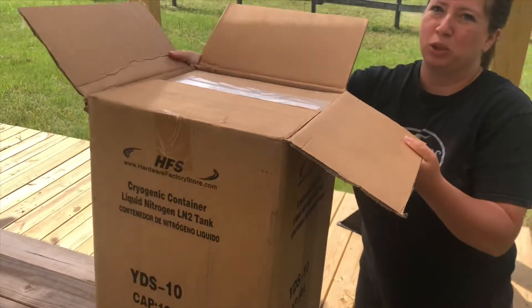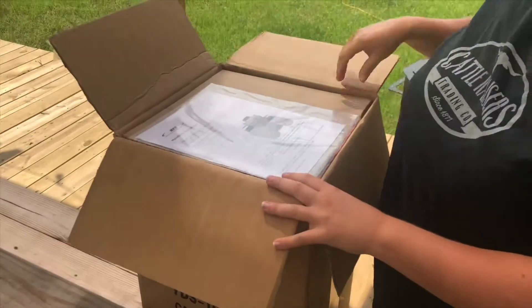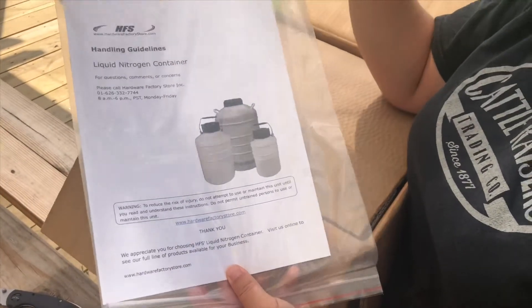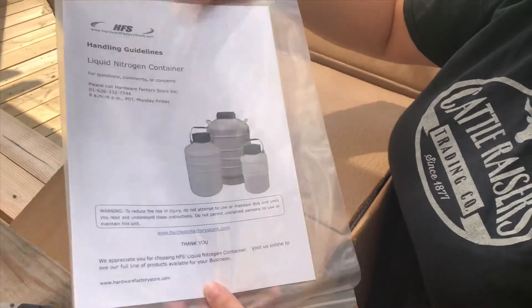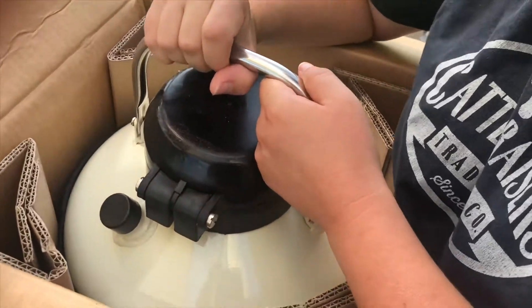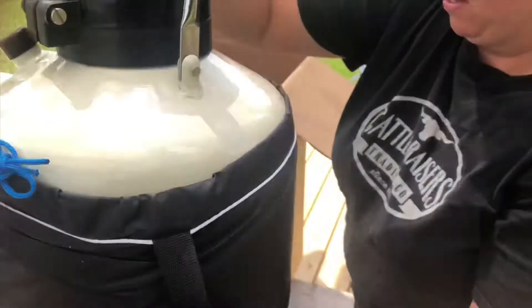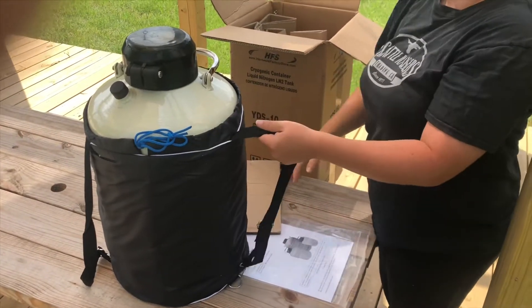I'm going to pull it down to my level because I'm a short person. Just a little bit about it — the handling guidelines and everything else. Of course, if you're ever messing with liquid nitrogen, please wear gloves. I know a lot of people don't. This is the actual tank itself — here we go.